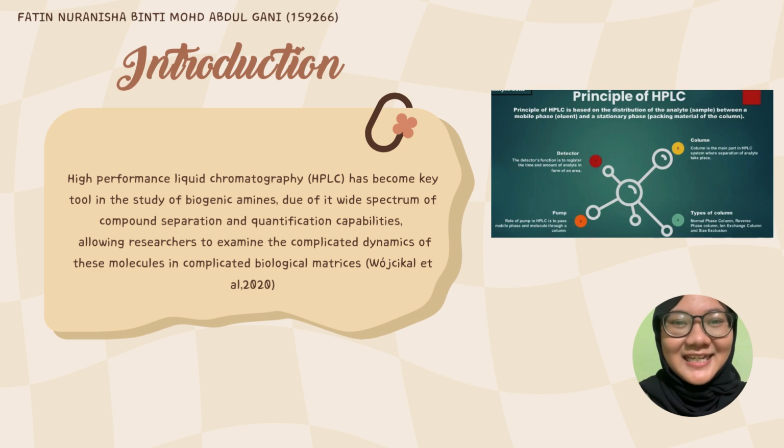Meanwhile, HPLC is known as high-performance liquid chromatography, a technique of separation. It's a key tool in the study of biogenic amine. There are two phases in HPLC, which are the mobile phase and the stationary phase. The wide spectrum of compound separation helps in the study of complicated biological matrices. That's all from me. Thank you.